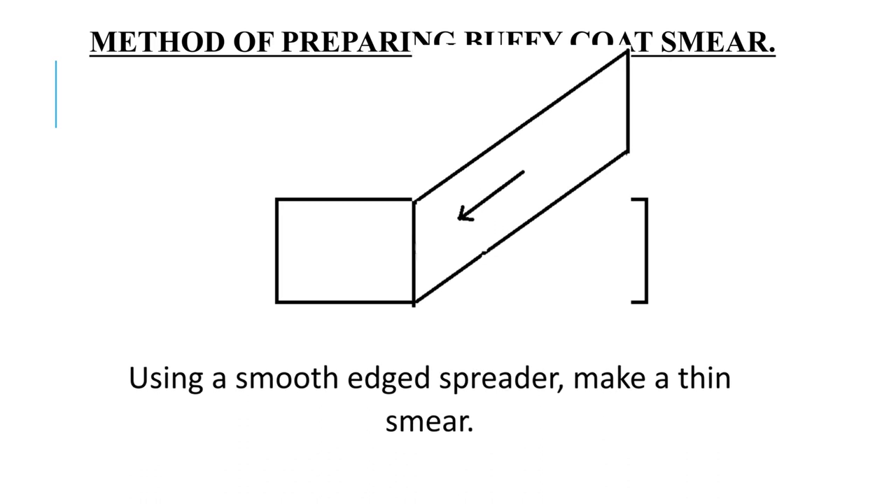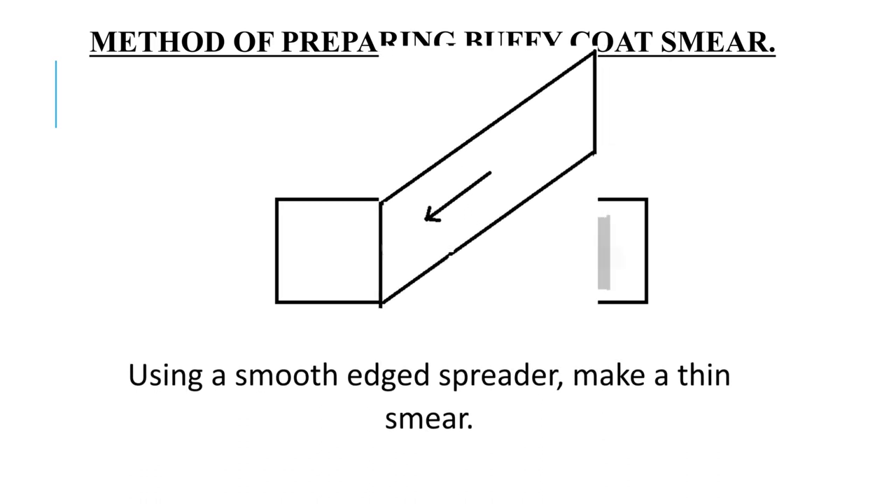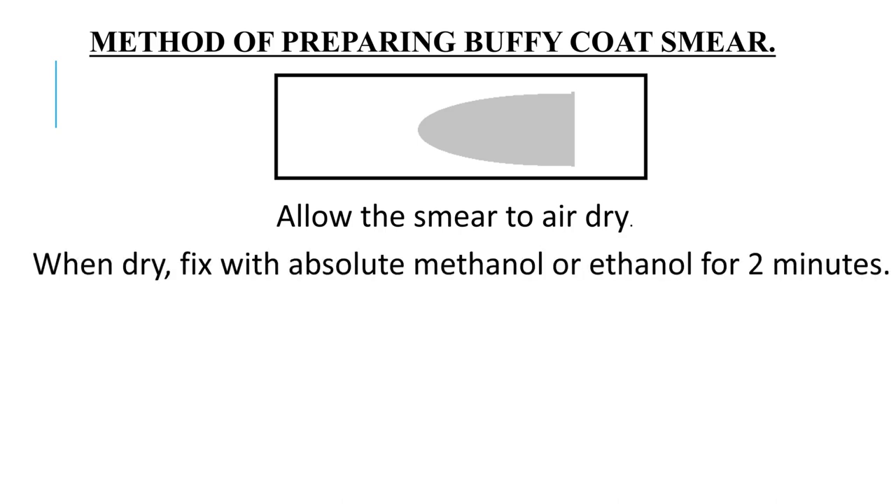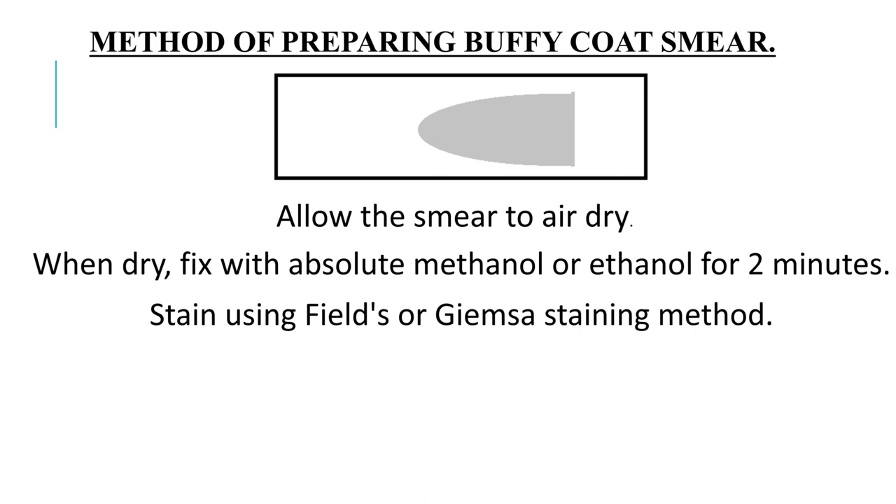Using a smooth edged spreader, make a thin smear. Allow the smear to air dry. When dry, fix with absolute methanol or ethanol for 2 minutes.